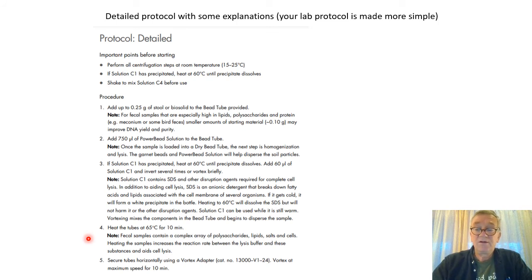Those steps you can read carefully, and we will briefly mention some of them. The first points 1 and 2 have already been done, because I have put the bacteria in tubes for you and added some PowerBead solution, so that there is some liquid there, and it also starts to act on the DNA.